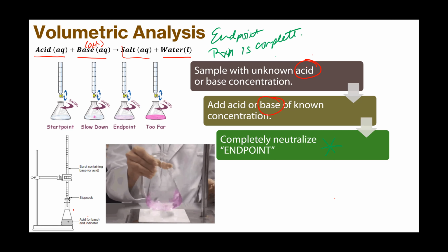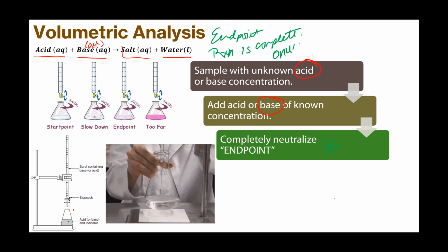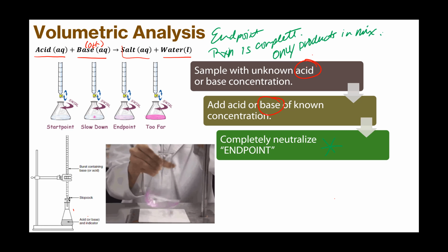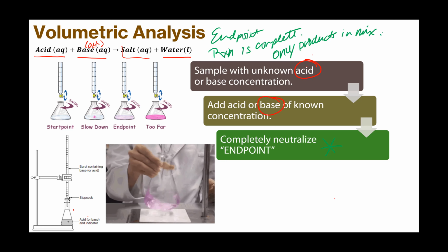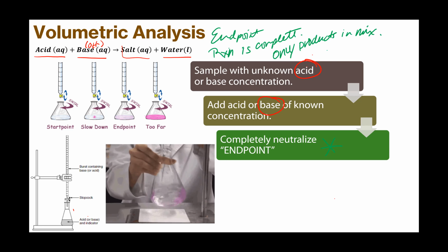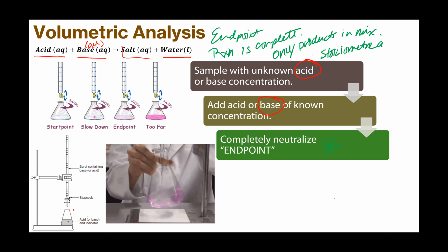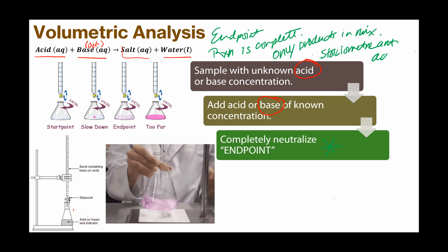There's only products in the mix. We could say a stoichiometric amount has been added. And the end point is the point where the balanced chemical reaction applies.